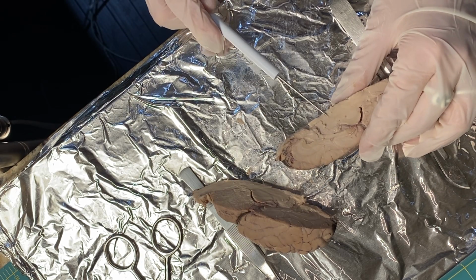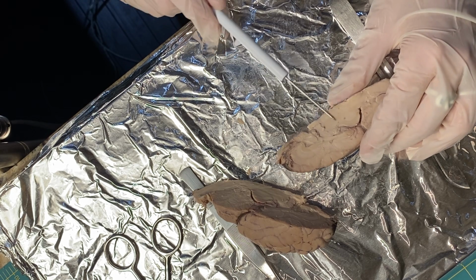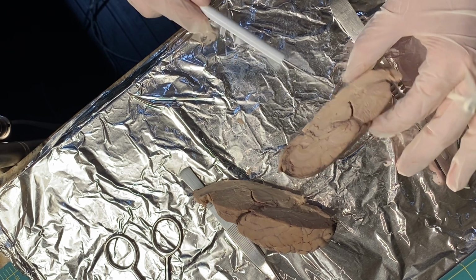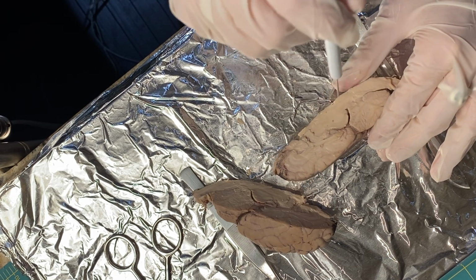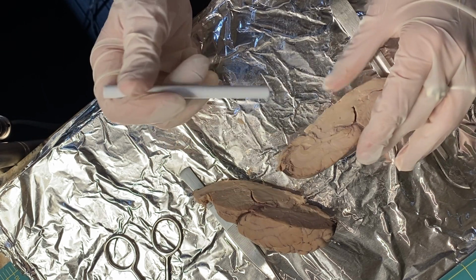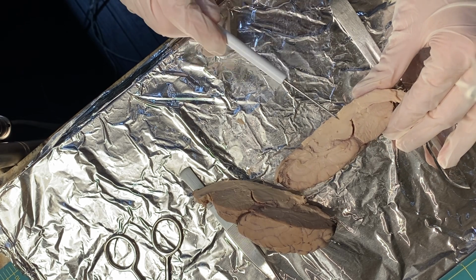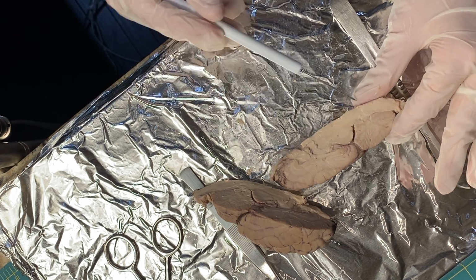So for the hypothalamus, we've got the hypothalamus down here. It's important to maintain homeostasis by controlling body temp, appetite, and fluid balance. So right here we've got the pons. The pons contain nerve tracts that connect the cerebellum with other parts of the brain and spinal cord. And then the medulla, which is right here, or brainstem. It contains centers for heart rate, blood pressure, and respiration.